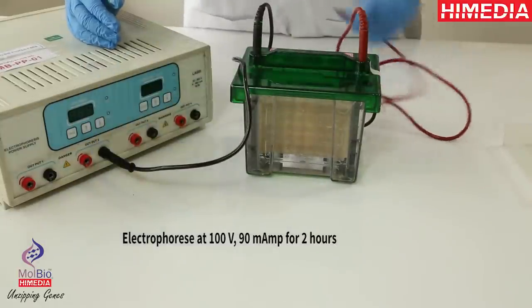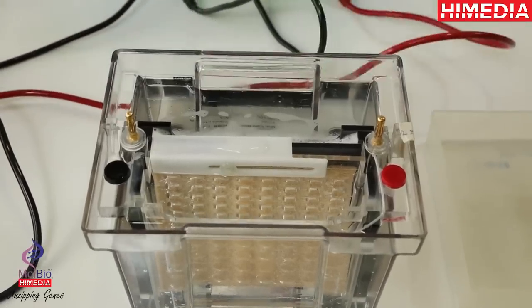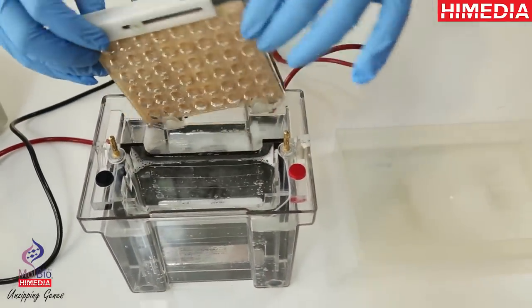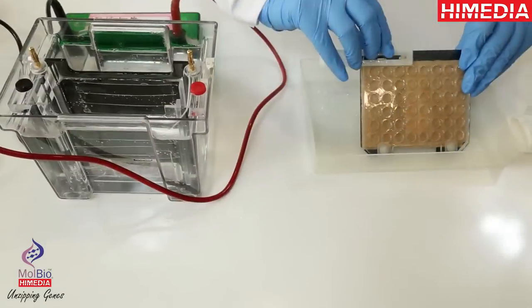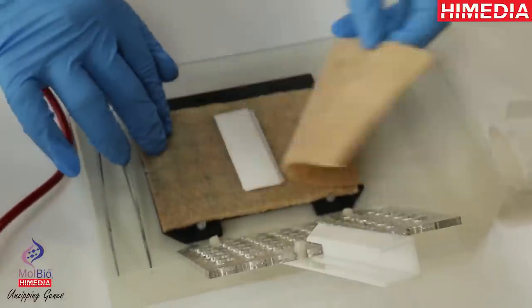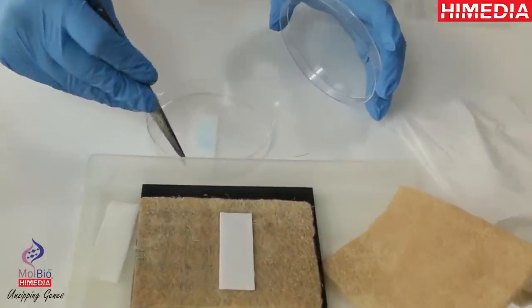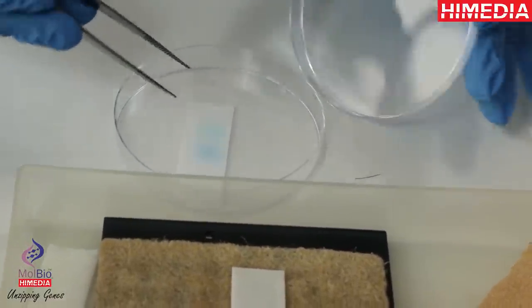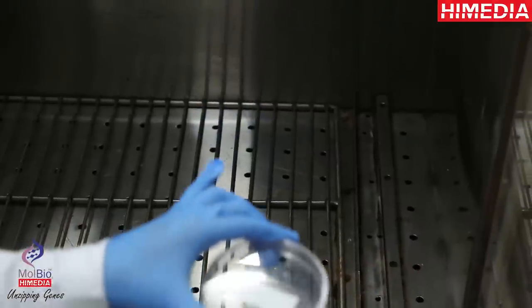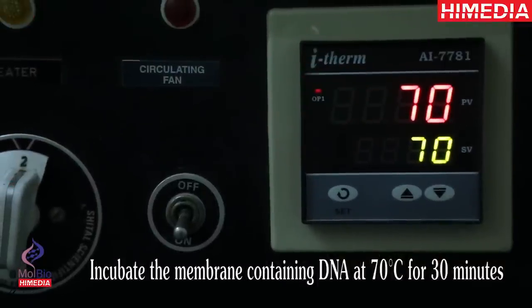Electrophorese at 100 volts, 90 milliamps for 2 hours. Remove the nylon membrane after transfer. Expose the membrane containing transferred DNA to UV for 20 minutes. Incubate the membrane containing DNA at 70 degrees Celsius for 30 minutes.